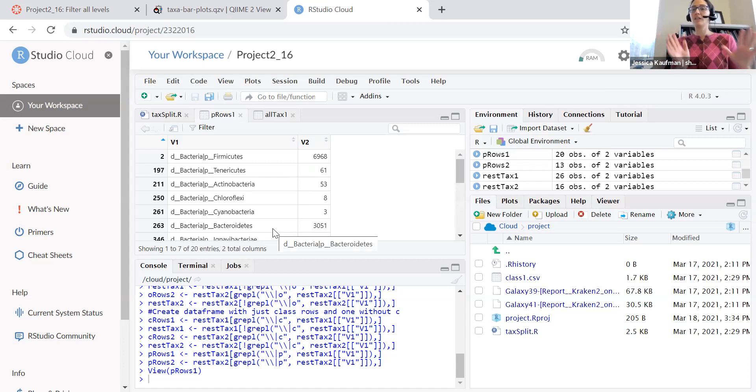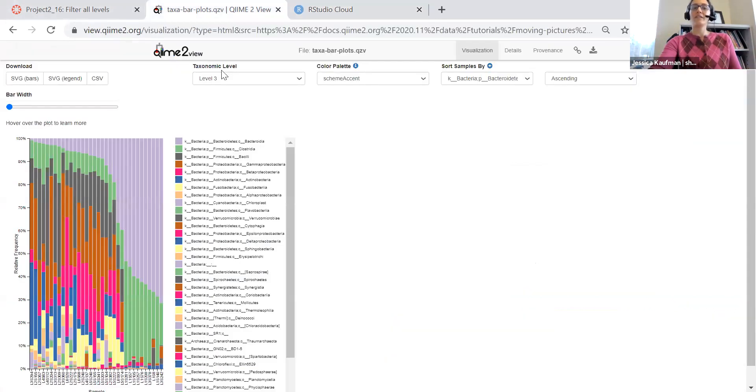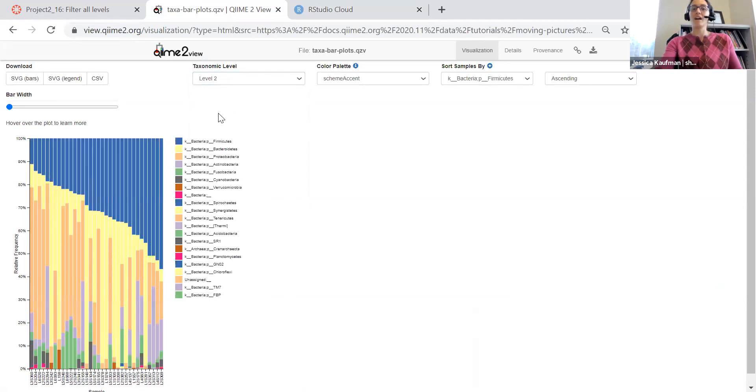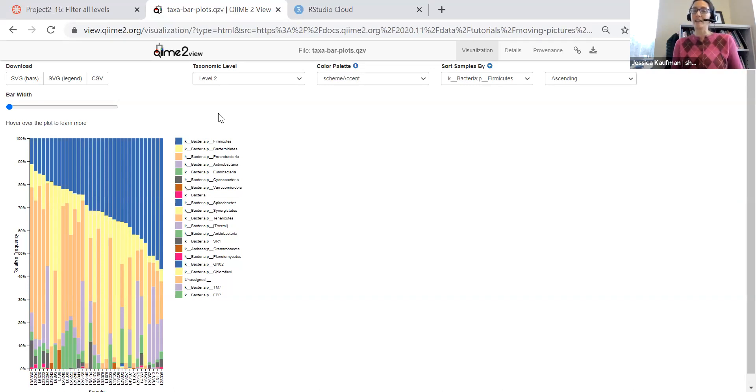And so this would make a beautiful plot and it would give me a very similar result to what I get on the QIIME 2 view website when I from the pull down menu select the phylum level of taxonomic bar plot.